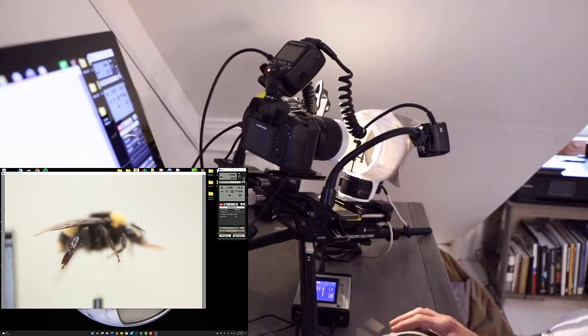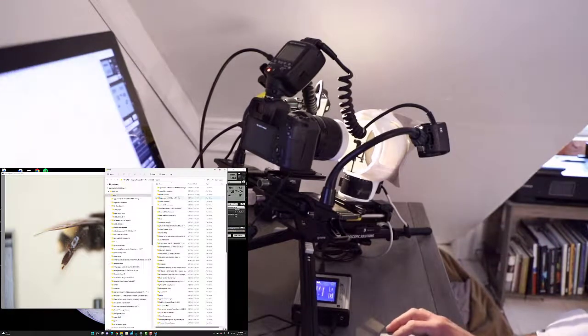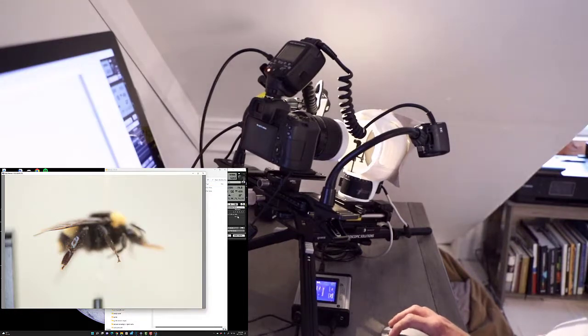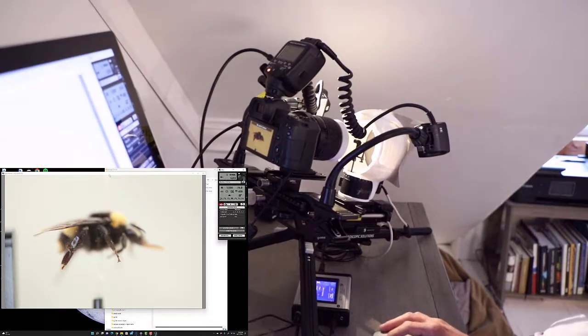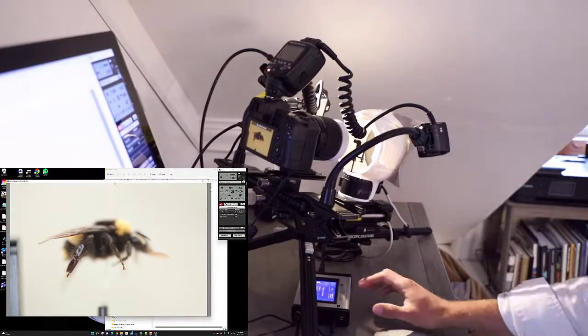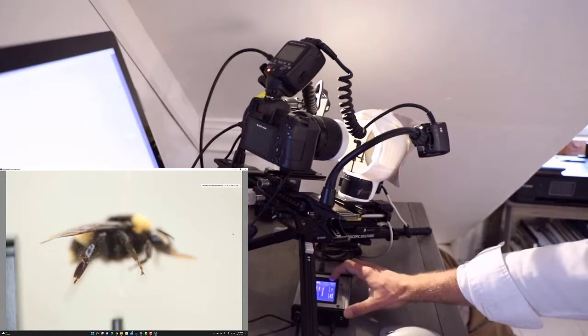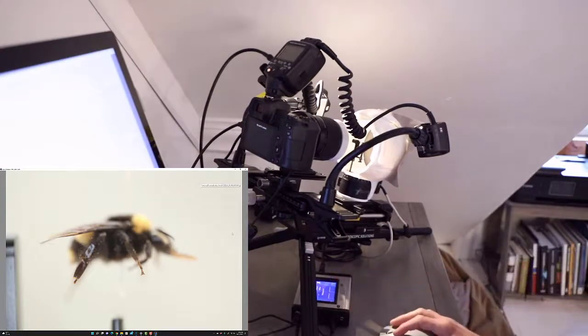All right, so from here we are completely set up. We just want to delete the few test images that we've just captured. So those are here. And go ahead, we're going to press start and we can watch this stack. I'll speed it up for everyone, but we'll press start and get this running.